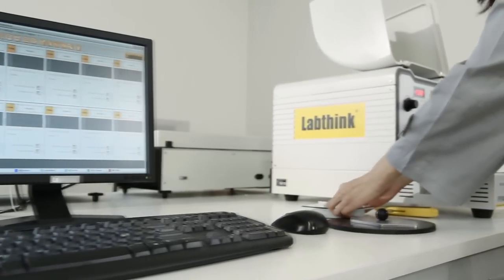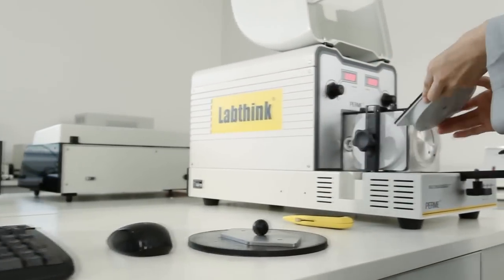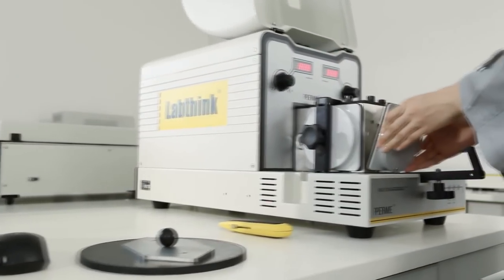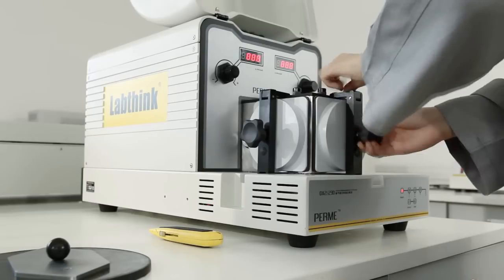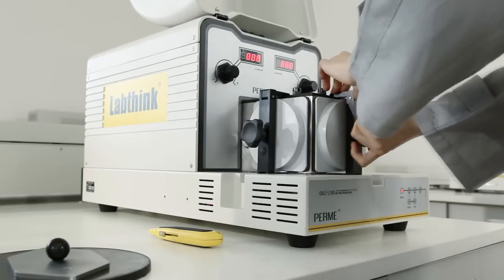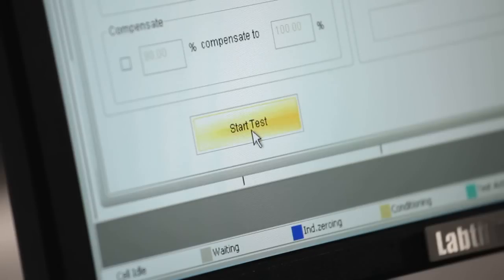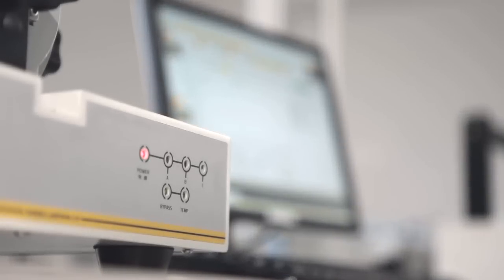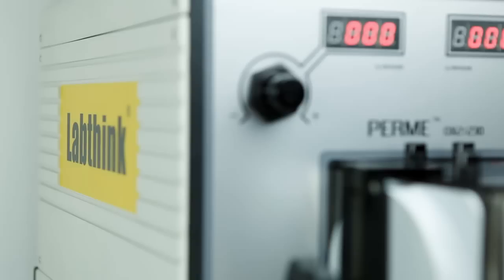Operating the instrument is simple and convenient. Users only need to place the prepared specimen into the test chamber, complete the parameter setting and click on test. The OX2230 will then automatically accomplish the test.